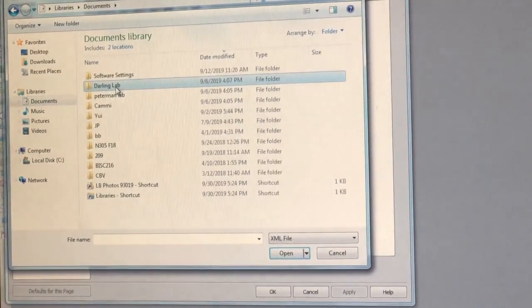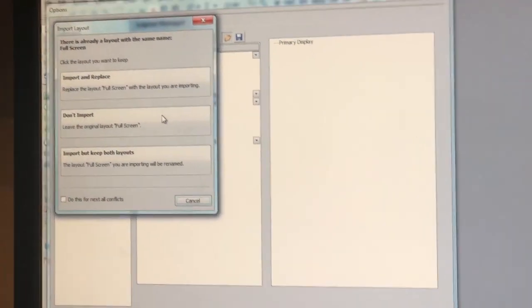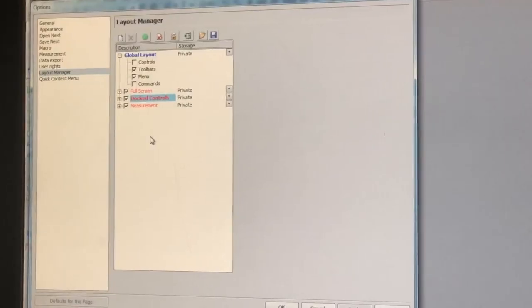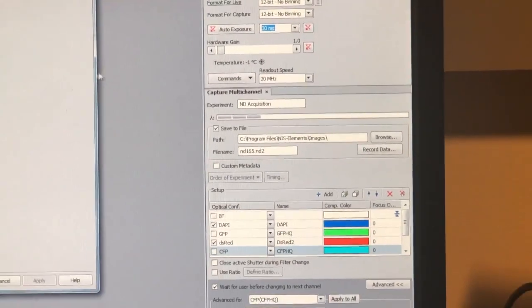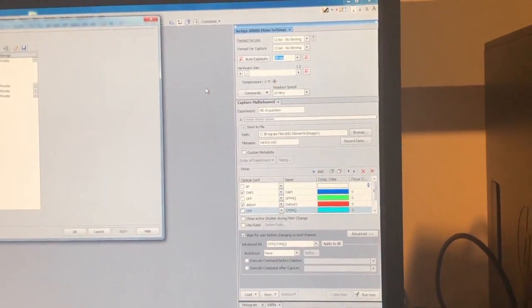Find the Darling Lab folder, click Docked Controls Layout, and then open that, and then click Import and Replace. Back in the Layout Manager window, click the green circle. Now you should see on the right-hand docked panel all 3 sections.